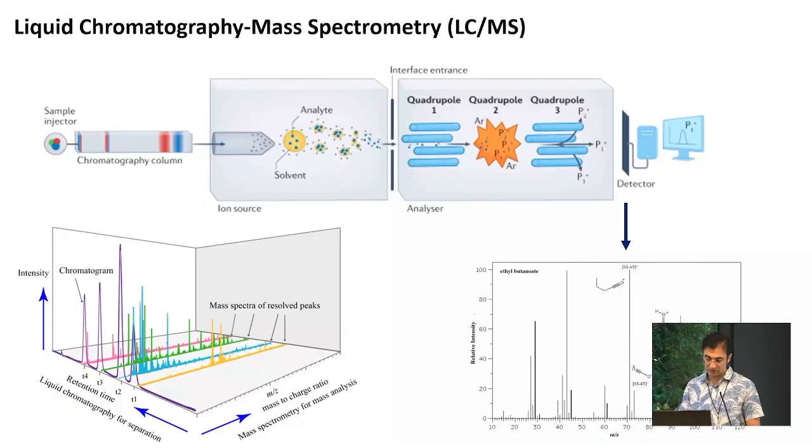I also need to add that the data collected from mass spectra are very complex. I just showed the mass spectrum here, but it also has other dimensions like retention time and other properties, or even more mass spectral space. So data can be 3-way or 4-way. But in this presentation, we only focus on mass spectra.